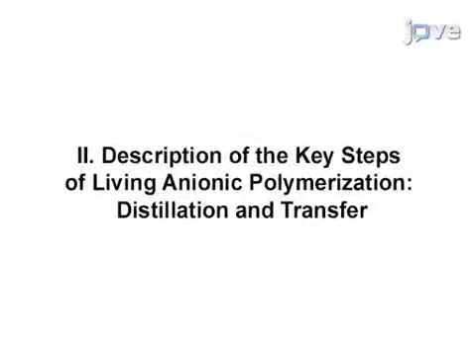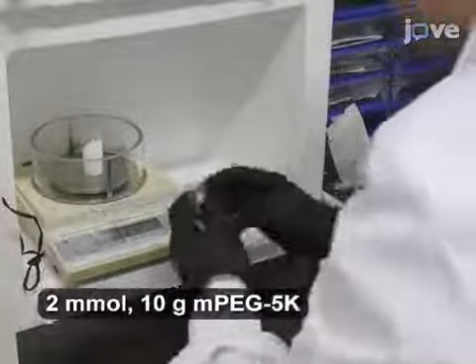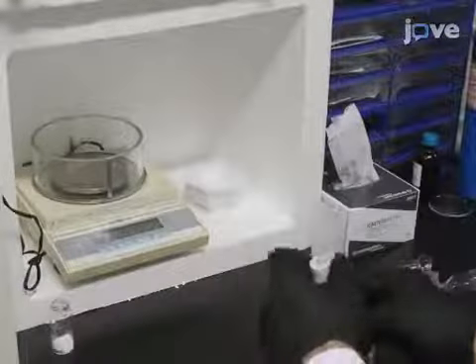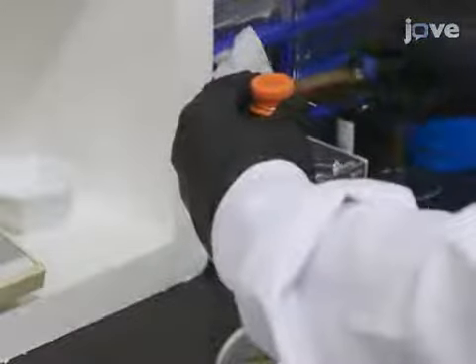Prepare reagents and materials for the transfer as described in the text protocol. Weigh methoxy-polyethylene glycol with a molecular weight of 5,000. Add the mPEG into a dried flask containing a stir bar and seal the flushing adapter with a septum at the top.